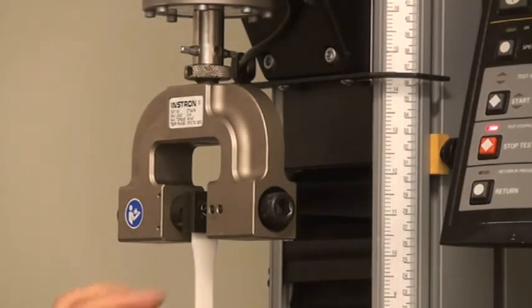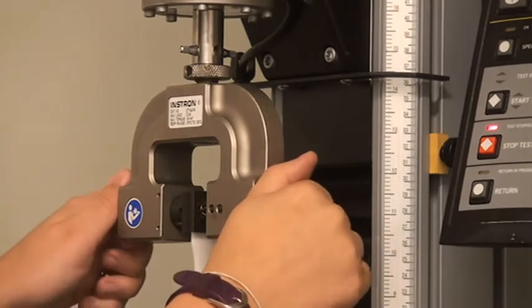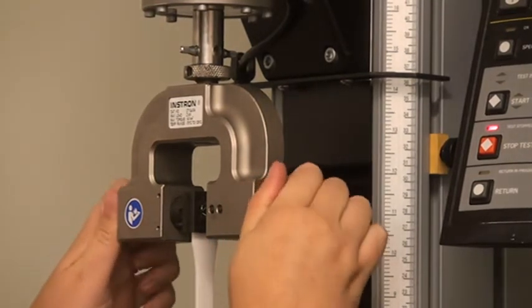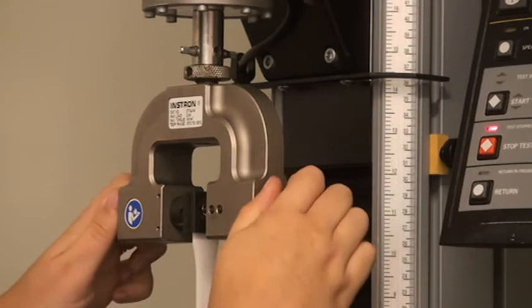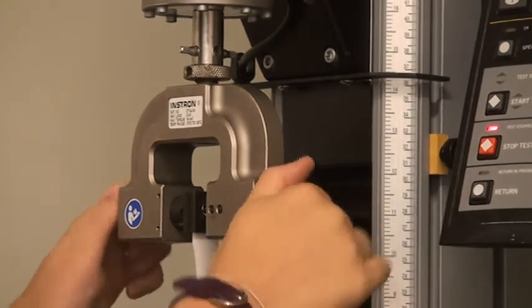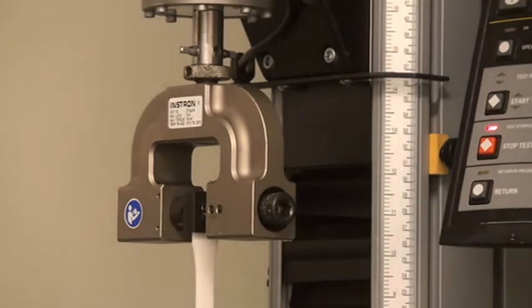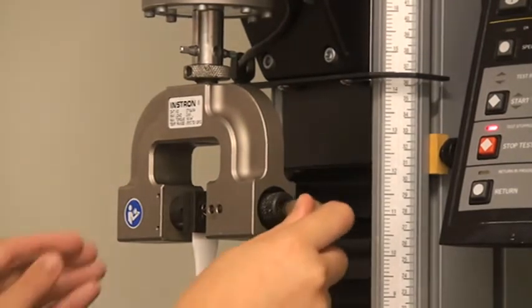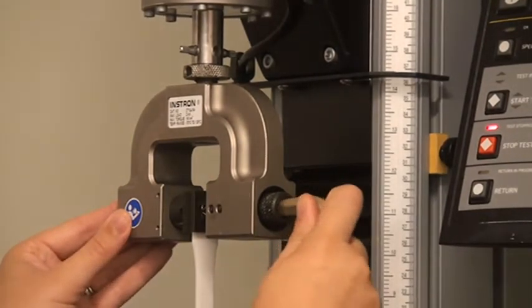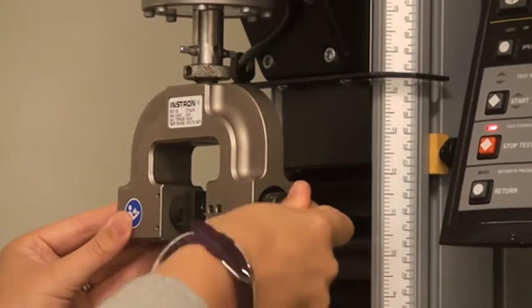Using the markings on the sides of the carriage as a guide, use the screw knobs to make sure your sample is centered in the upper grip. Use the hex wrench to tighten the screw knobs on one side to prevent the sample from slipping during testing.